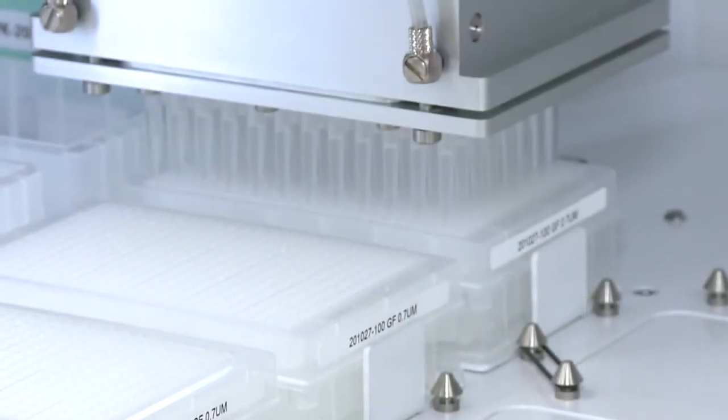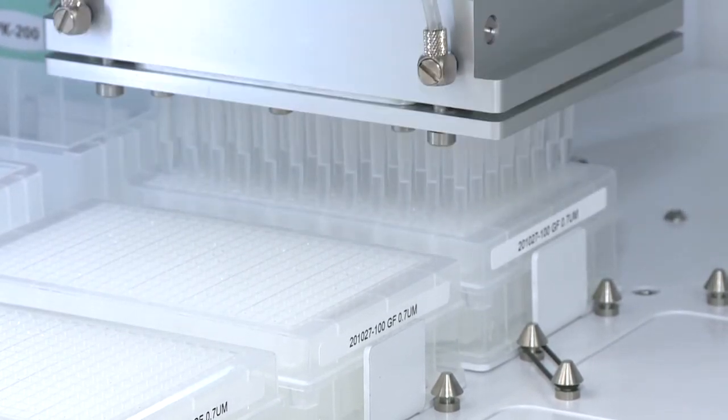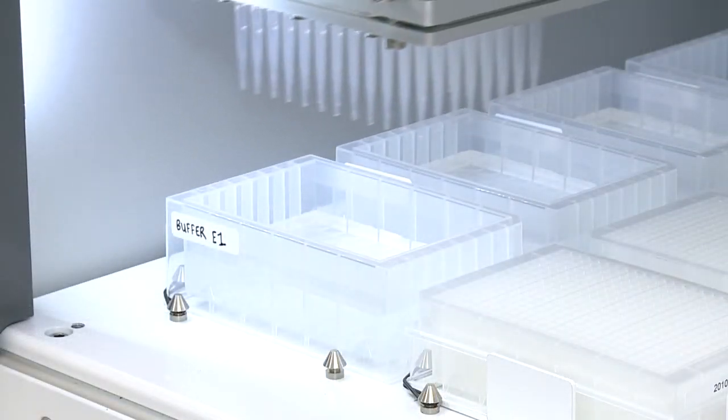As with all our systems, they are fully LIMS-integratable, meaning you can track all of the samples processed through extractions, then arrayed to DNA, ready for the next step in your workflow.